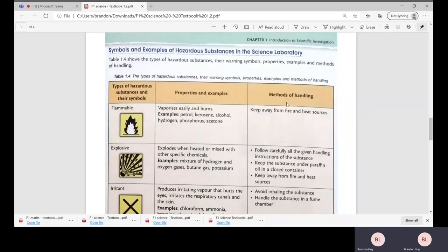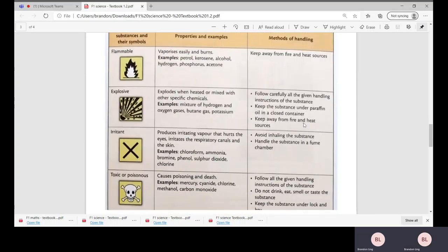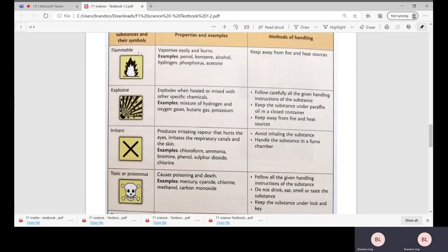Certain symbols are usually associated with different types of chemicals in the lab. First we have the flammable type. As the picture shows, it basically shows chemicals which are easily flammable—they can vaporize easily and burn. For example, petrol, kerosene, alcohol, etc. The method of handling will be: keep away from fire and heat sources, otherwise they may explode or burn.